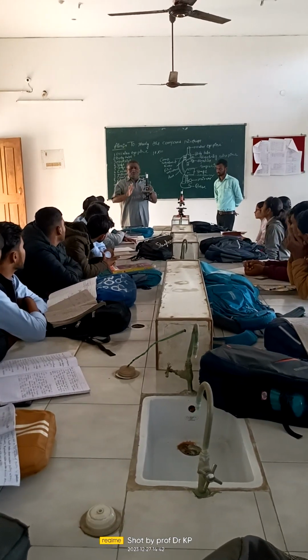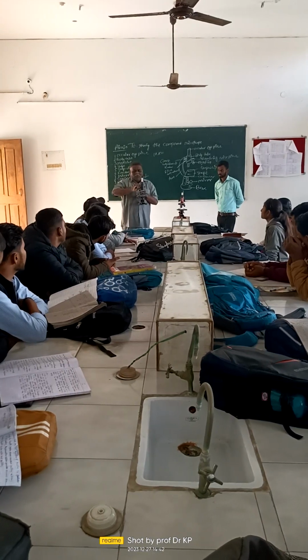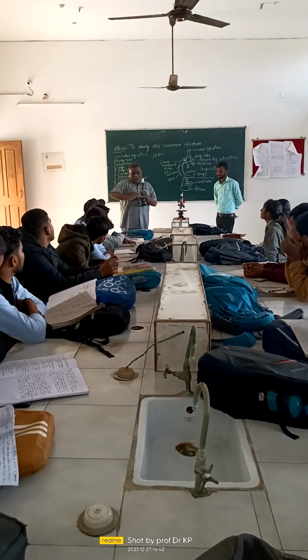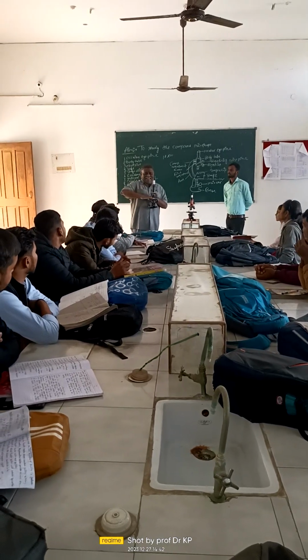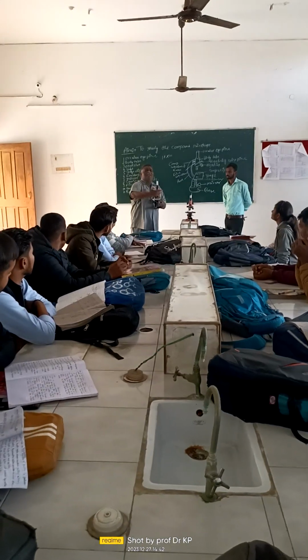Always when you get the microscope from your teacher, you must raise the body tube as much as possible in order to keep enough distance between the objective and the stage, so that placing the material, or using your hands to use the clips to hold the slide, will be easy for you.